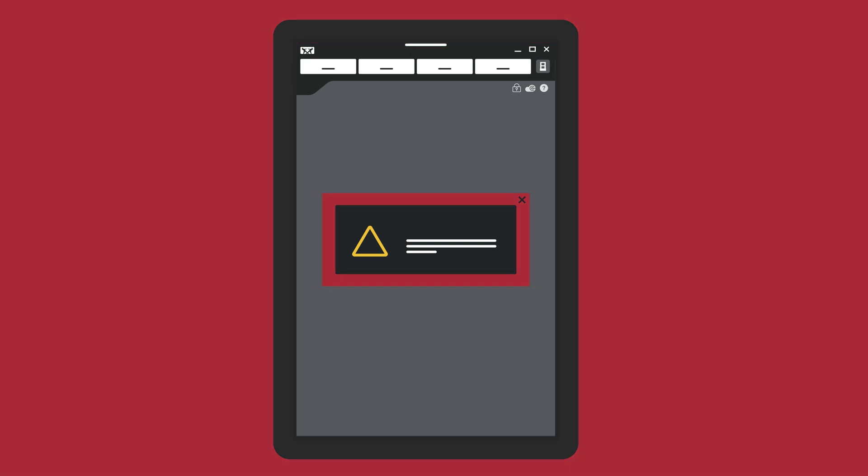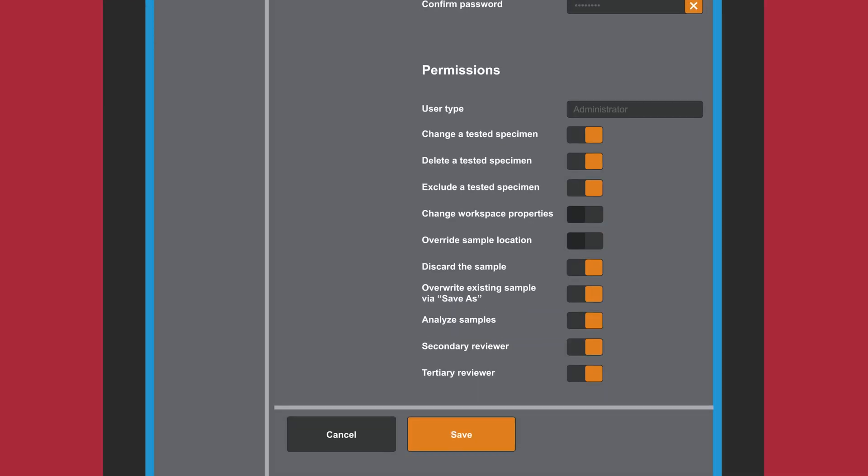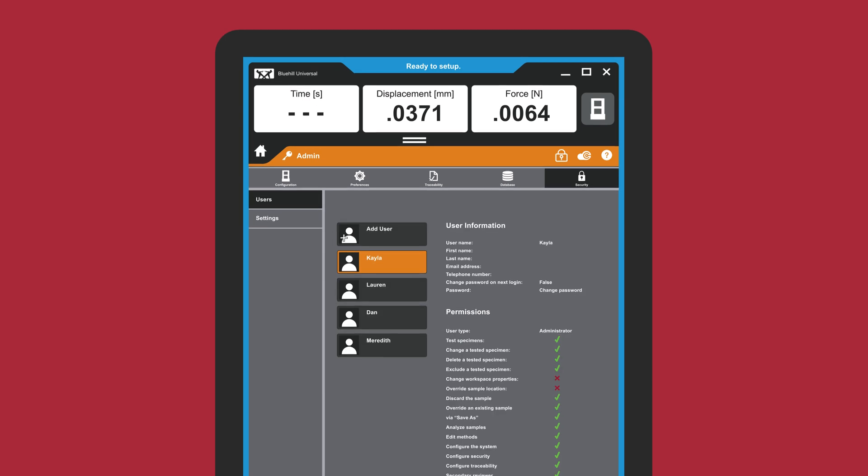Bluehill Security allows lab managers to configure permissions, granting and limiting access where needed to ensure your system's settings and test methods are controlled.